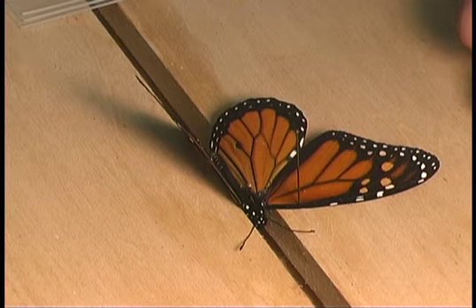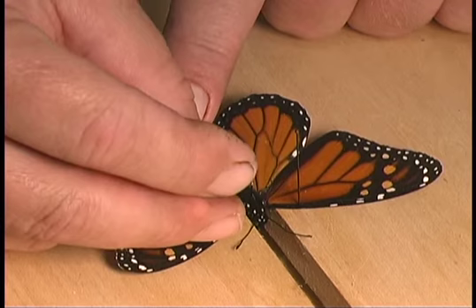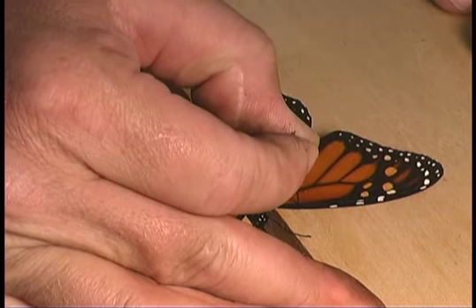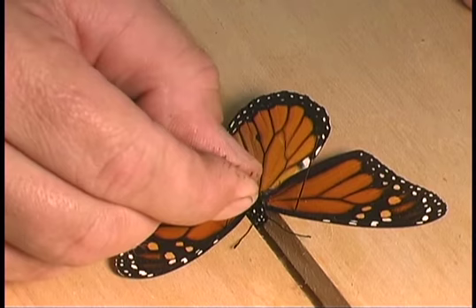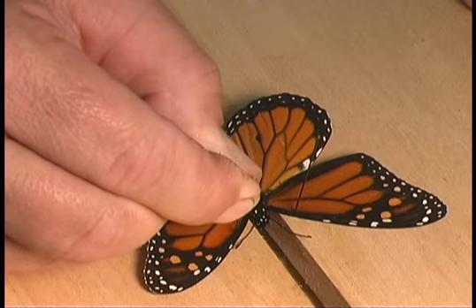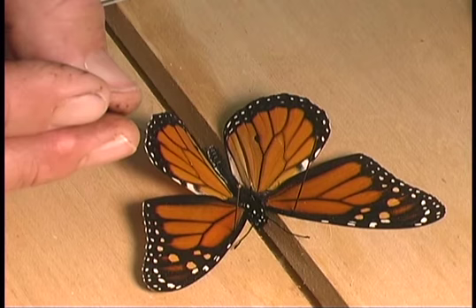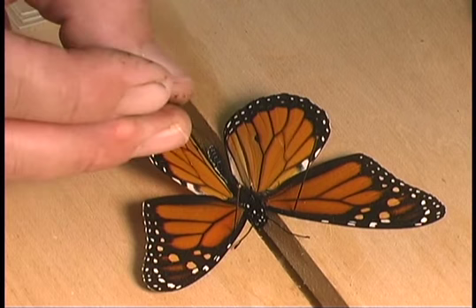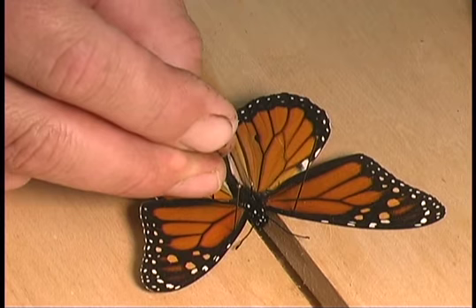Repeat that on the other side, pulling that wing slightly forward as well. Continue to move each side forward a little at a time until the bottom margin of the forewing is perpendicular to the body of the insect — that is the general rule of thumb when mounting Lepidoptera. Then look at the apex of the hind wing near the upper margin where you will also see some veins. Make sure that when you insert the pin to the hind wing it's behind one of those veins, which will keep you from tearing the wing when you pull it forward. Move it only slightly forward.